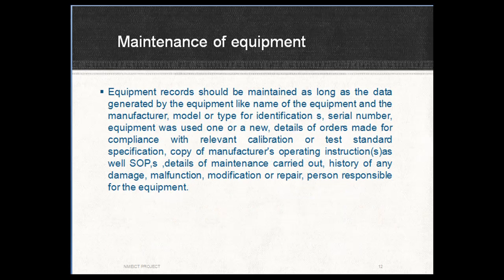Equipment records should be maintained as long as the data generated by the equipment is retained. Records include: name of the equipment and the manufacturer, model or type for identification, serial numbers, whether the equipment was used new or second-hand, details of the order made for compliance, calibration tests and standard specifications, copy of the manufacturer's operating instructions as well as SOPs, details of maintenance carried out, and history of any damage, malfunction, modification, or repair.